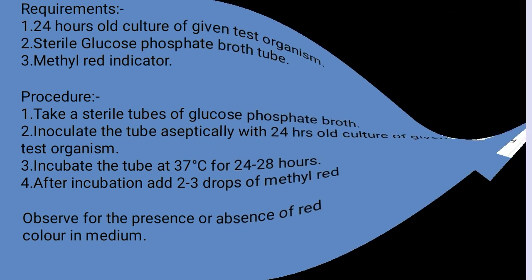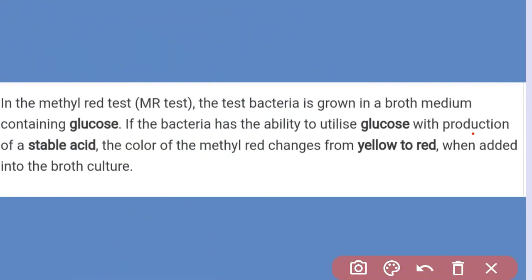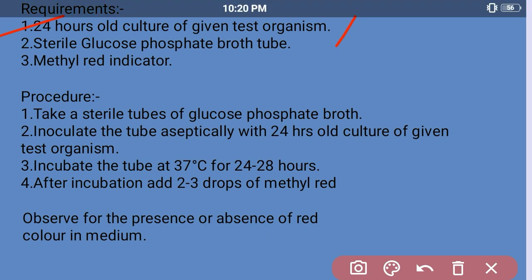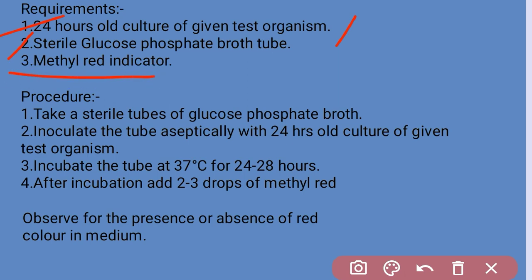Requirement for this test: first requirement, a 24 hours old culture of a given test organism, or simply we can say a water sample. The next, sterile glucose phosphate broth and a methyl red indicator. These are the requirements for the methyl red test.